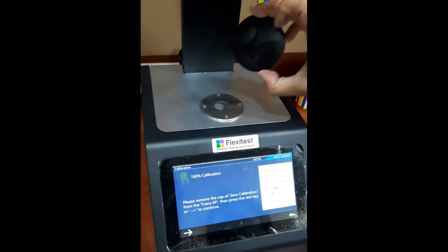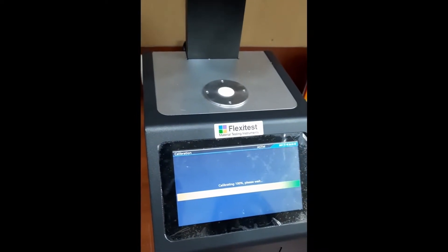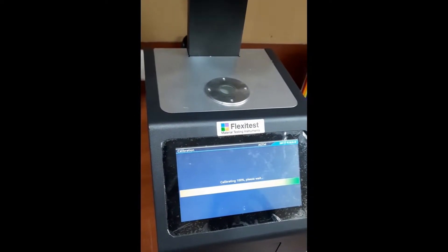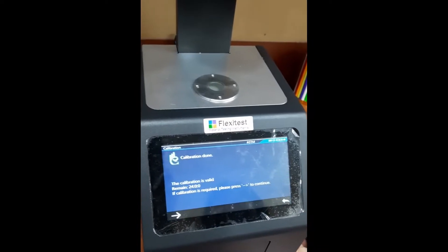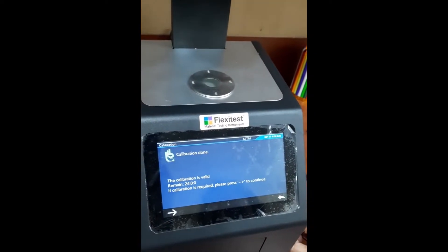I need to remove this cap. And now I will go for 100% calibration. Calibration is done. And this is valid for 24 hours.